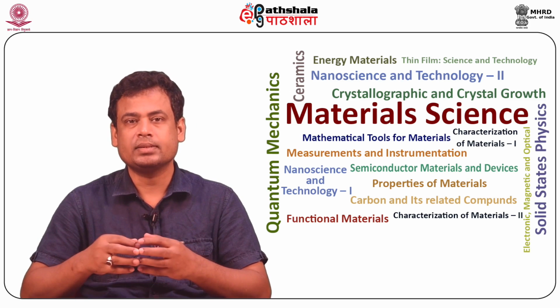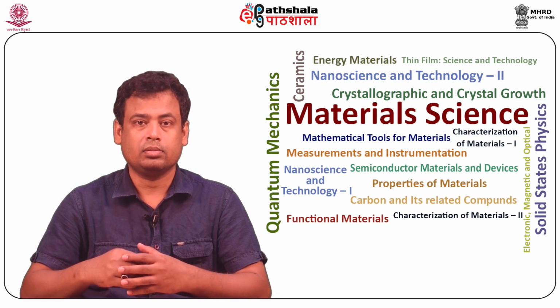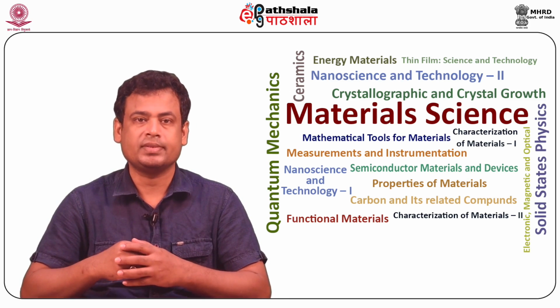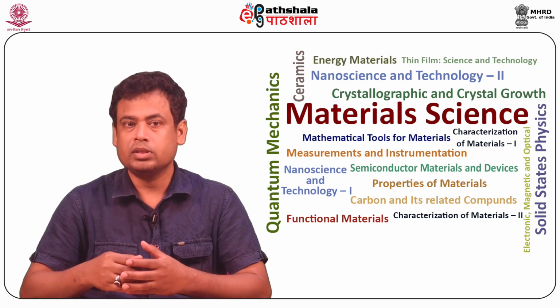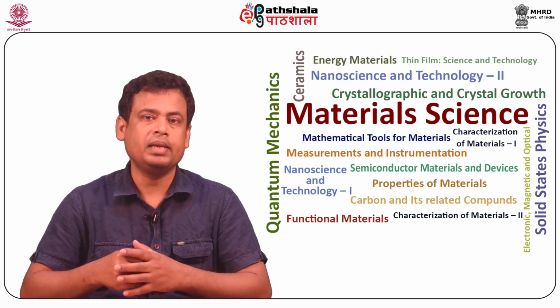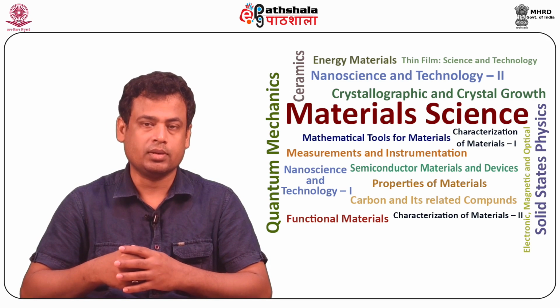Also, XPS instruments are able to generate depth profiles of the chemistry of the surface layer through the bulk material and reveal the spatial distribution of elements on the surface and inside layers of the bulk material.